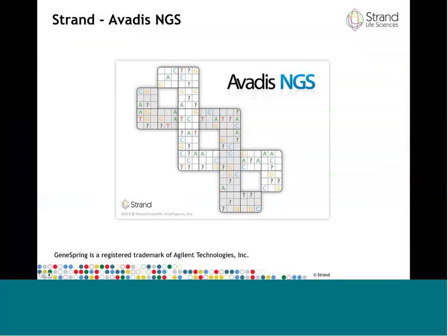Avadis NGS has been designed for biologists, which means it's been designed to insulate users from the complexity and size of NGS data by hiding the complexity behind easy-to-use workflows and visually appealing windows into the data. For those of you who are familiar with GeneSpring, the user interface is very similar to that in GeneSpring. Several thousand researchers around the world use GeneSpring, so the learning curve should be quite short. Even for those of you who haven't used GeneSpring, we believe that Avadis NGS will be quite easy to use.